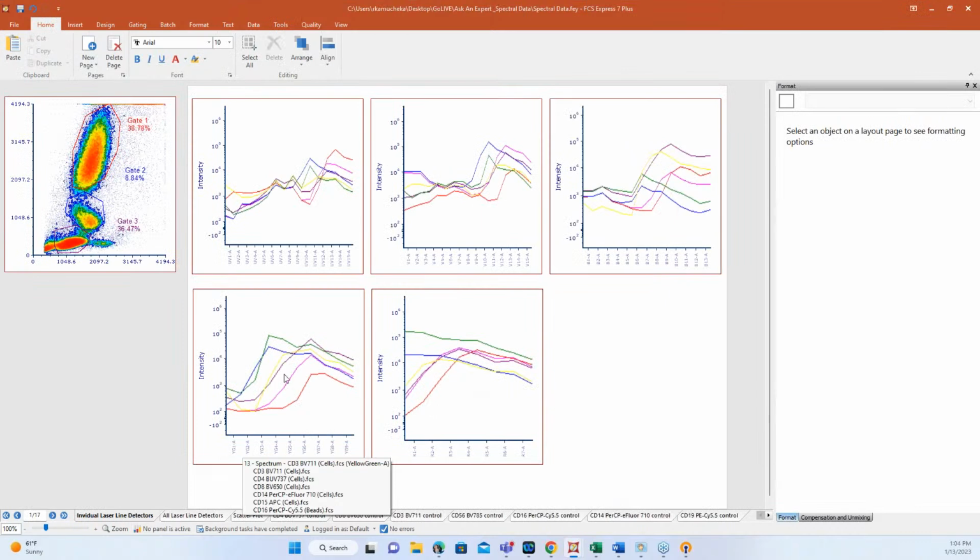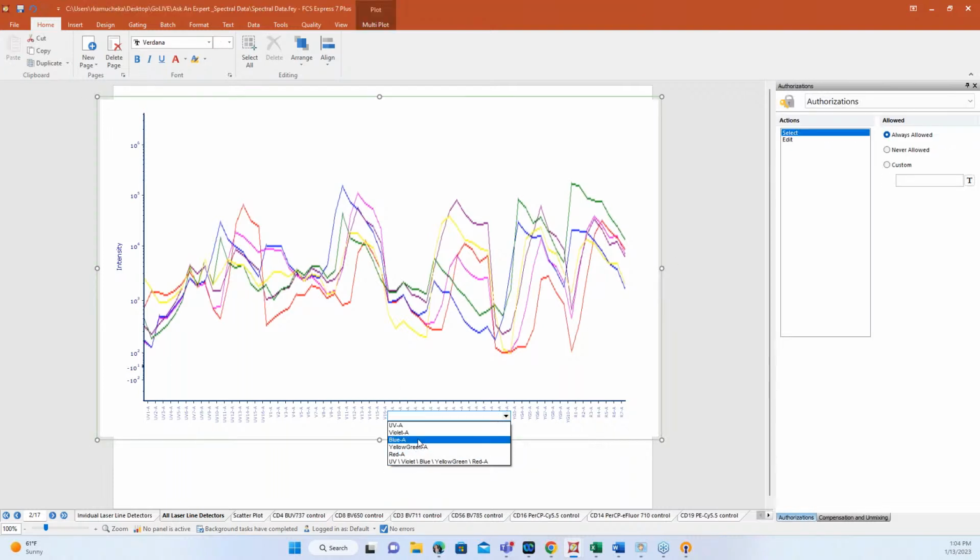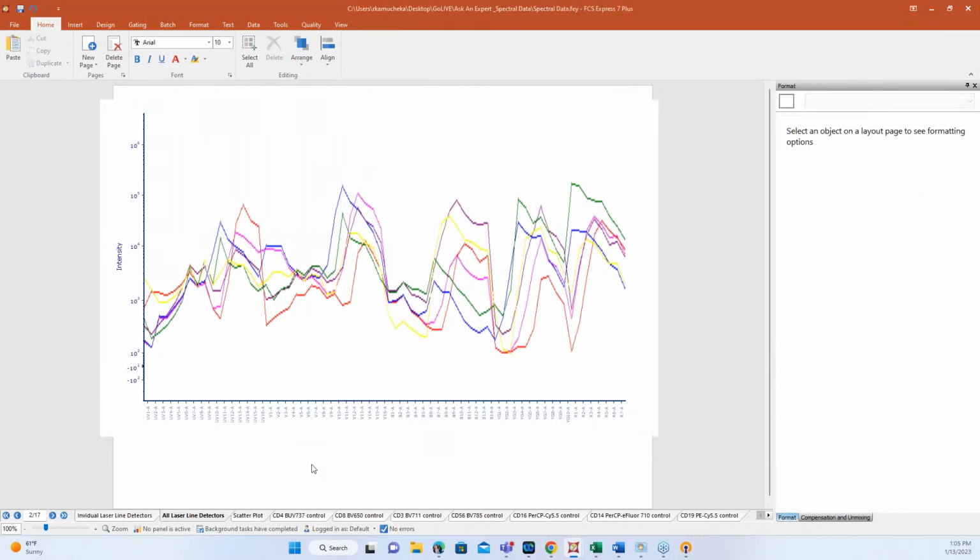If you are going to be using FCS Express to unmix your data files, of course, we have different laser lines, right? So whatever your system has, we're going to be able to separate out, and then you'll be able to also see in FCS Express, we can bring in your signature across all the lasers. So this is just changing a parameter just like you would with any 2D plot. This is just our spectrum plot to show you those signatures so we can see the differences of how our fluors are operating. How can we separate this out, right? How do we decide what channels are peaks and things of that nature? That kind of brings us into the unmixing part.